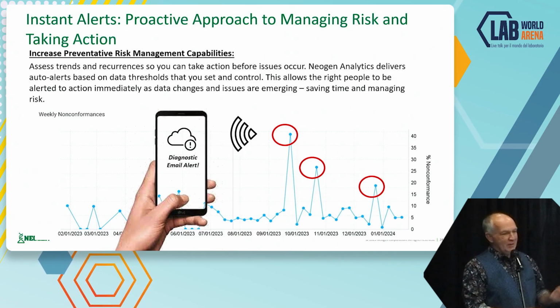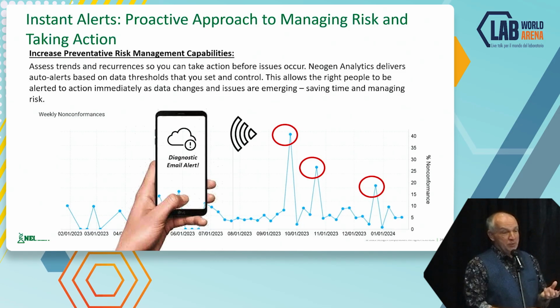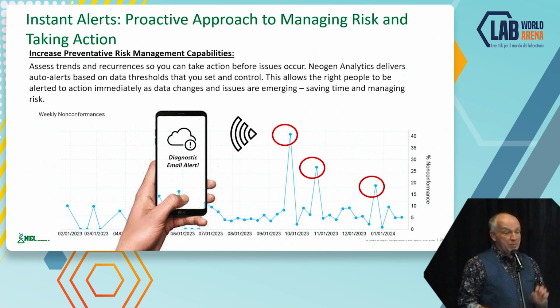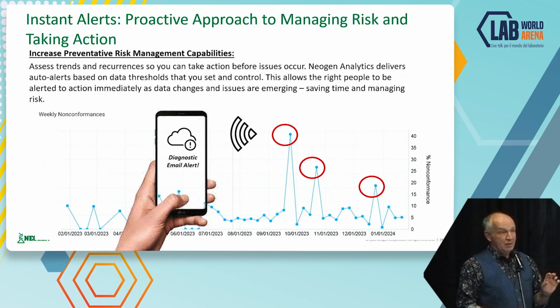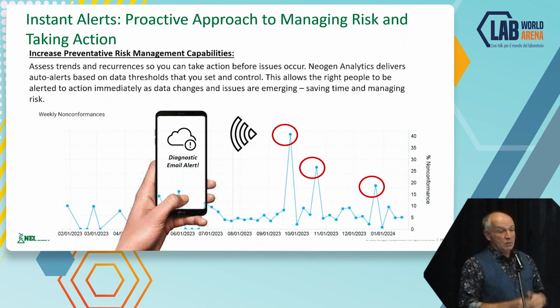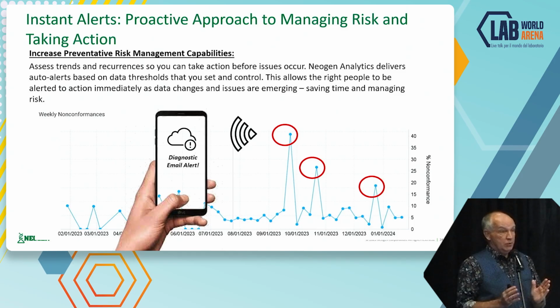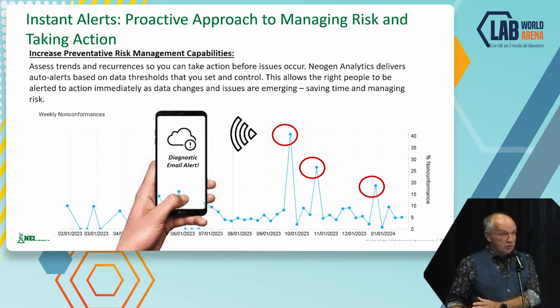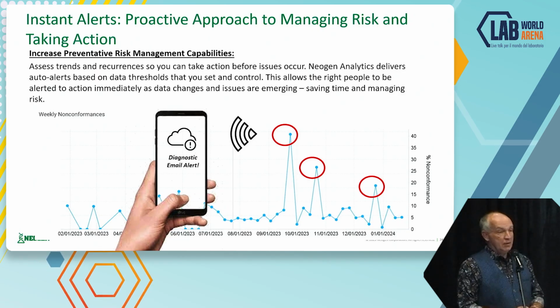We have one chart here, I don't have it on the slide, but it's called the management chart. It's showing also the whole situation with green fields. Green is great, nobody will react. Yellow, people start to think, okay, what's going on? They might start to ask questions. If management see red dots, they immediately react. What's going on? What do we need to do here? So having the data available, all the data, but being able to condense it from data to information and from information to reaction or action is something that is really crucial today.